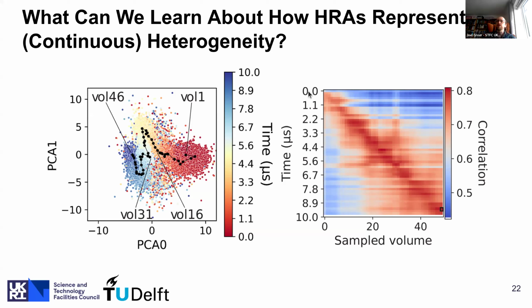So we compute the map to model real space correlation between these, and we see that we actually get a much higher correlation between atomic models and sampled volumes which are essentially close in time in the MD simulation to each other. So here, a high correlation value is expected to be about 0.7, and a low correlation generally expected to be about 0.5.